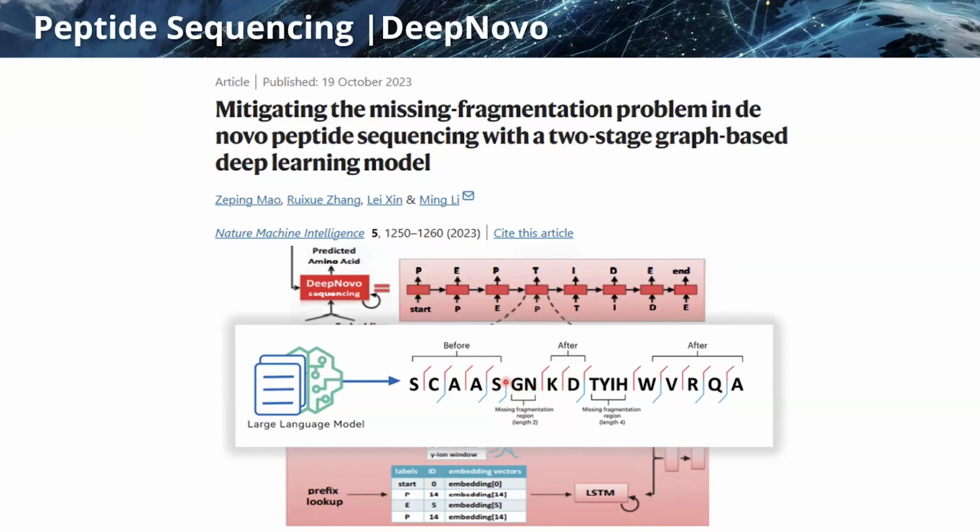And just the last thing I want to emphasize is that the final scoring for the peptide sequence will also look at the correlation of the predicted retention time and empirical retention time. So in addition to the fragments with intensities, we also correlate the predicted retention times.